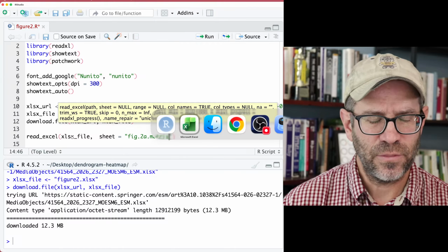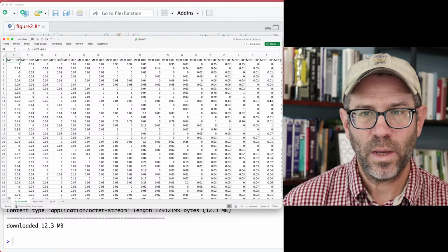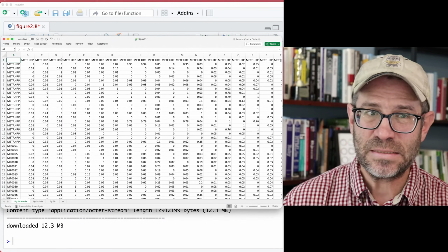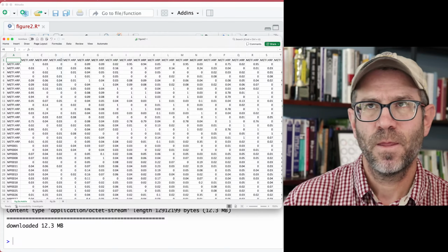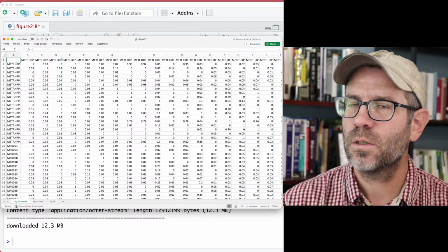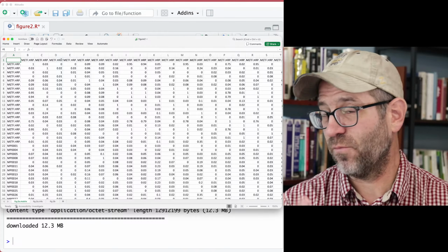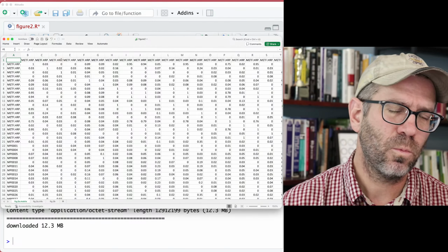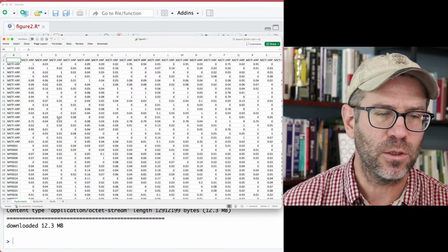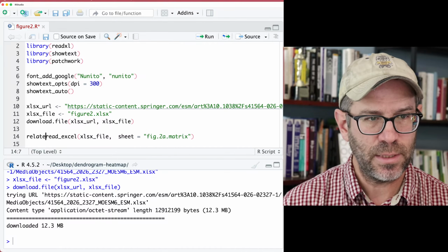And I think that looked pretty well formatted, right? Aside from being wicked long, this has 1,726 rows and columns. You'll recall if you watched the critique video that they talk about actually having more genome sequences than what I have here, or that they provide here. And so we probably won't have a perfect representation of what they had, but I think we should be pretty close. Okay, so I'm going to call this relatedness.